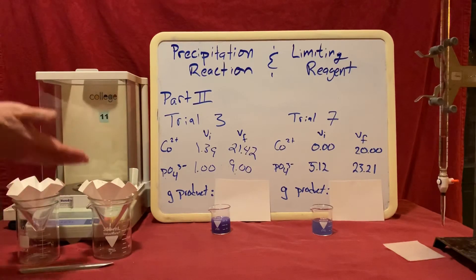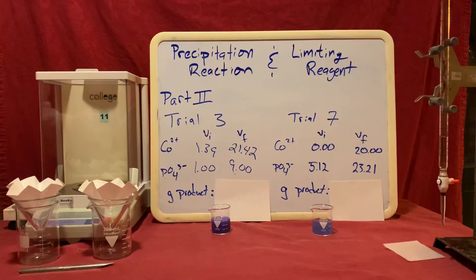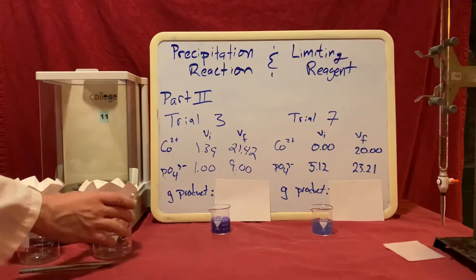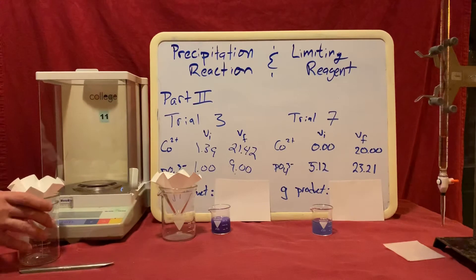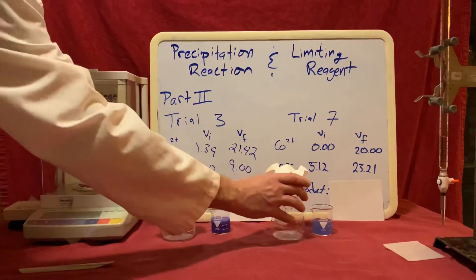This way, when my product ends up on the filter paper later, I'll be able to subtract out the mass of the filter paper in order to determine the mass of the product. So here's my trial 3 filter paper, here's my trial 7 filter paper.